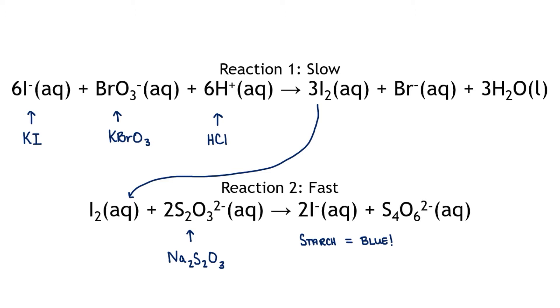We will carry out the experiment by combining the iodide ions, the hydrogen ions, the thiosulfate ions, starch, and enough water to make all of the volume levels equal. We will then stir our reactants and add potassium bromate last.